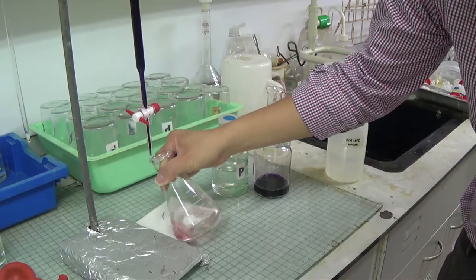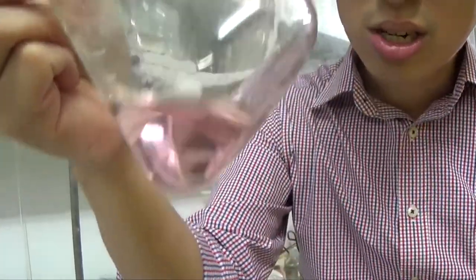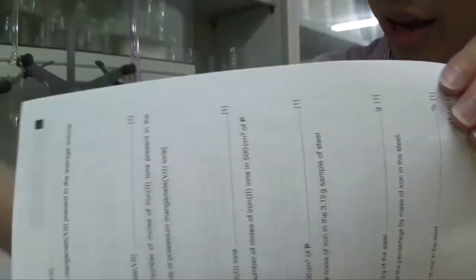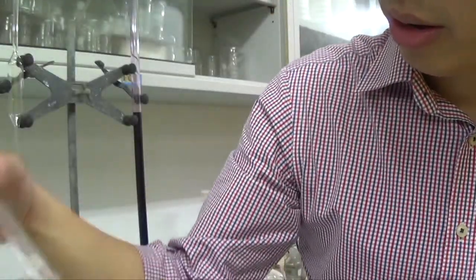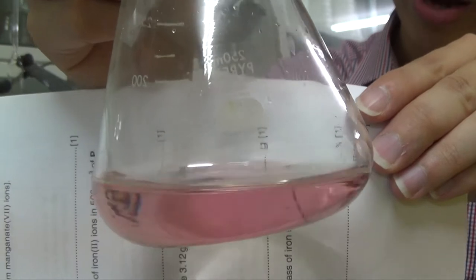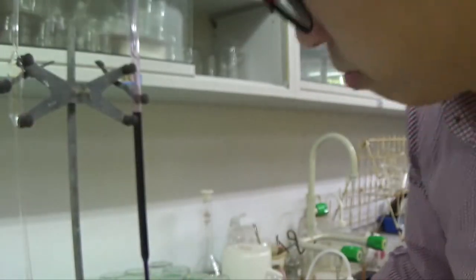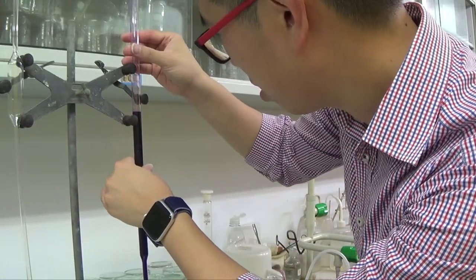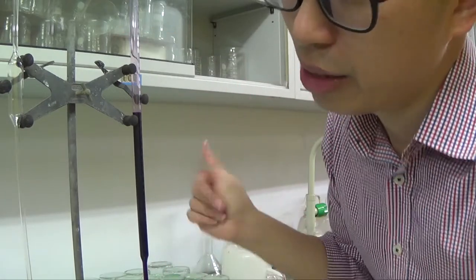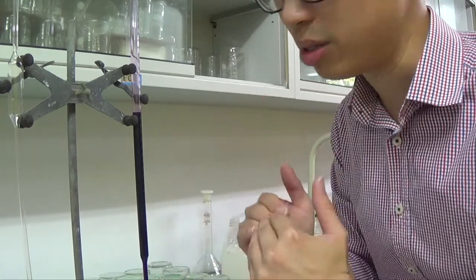I think I have just overshot by one drop, okay? So as you can see, the previous drop was just fine, but this is just a little bit pale pink now. Just now it was more like this kind of color, a little bit pale green, colorless. And if you could rewind the video by a couple of seconds, just before that one drop, it was still colorless, well, kind of pale green, but now it's gone a little bit pinkish, all right? So that is my end point, and I was being super accurate doing drop by drop. So I might have overshot by one drop, which is why I need to do another accurate titration to make sure that it is within plus minus 0.10 cm³.